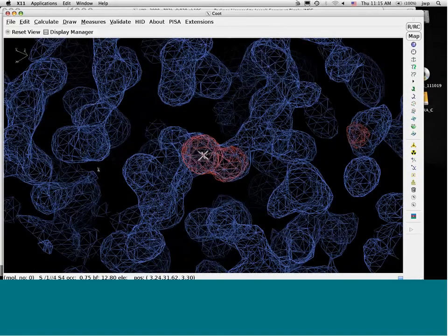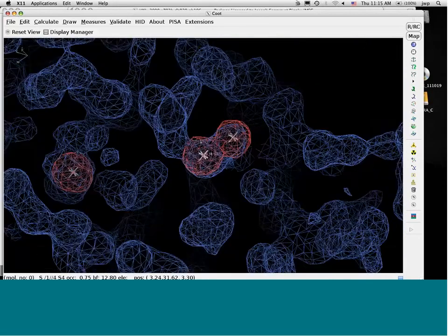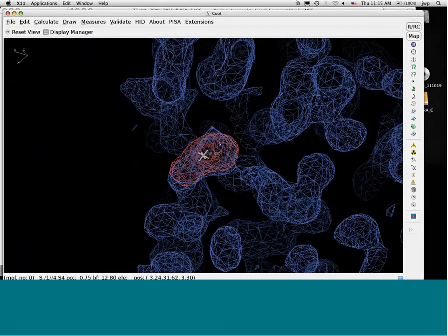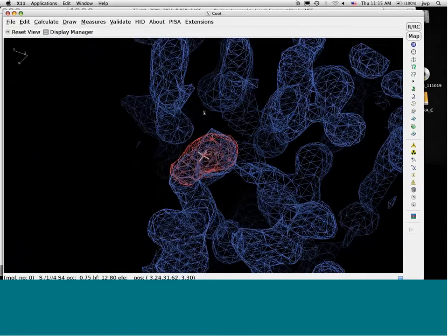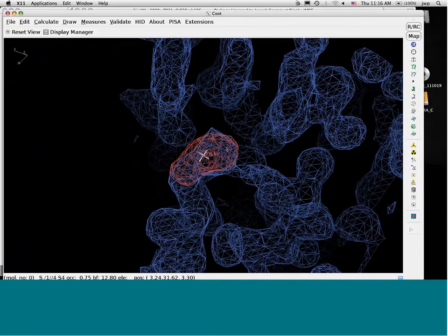So basically I would not be afraid to always try to fit the map, even if the map looks crummy. I mean, auto trace it with these new powerful methods. They do a great job. As for maybe radiation damage as things shift around, cut your data back and see if it helps you.